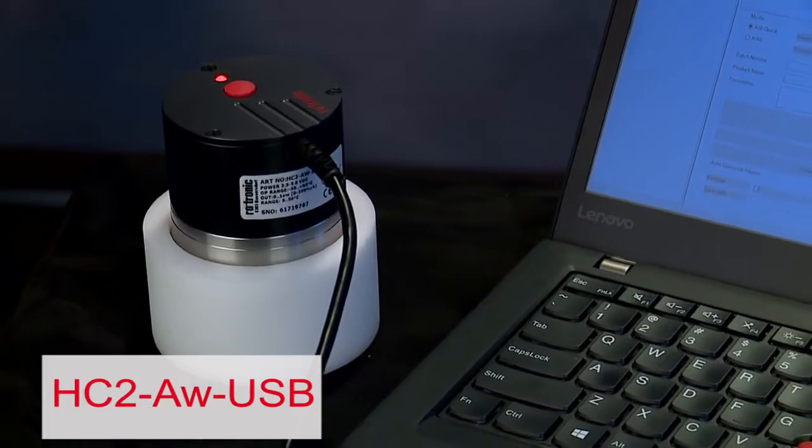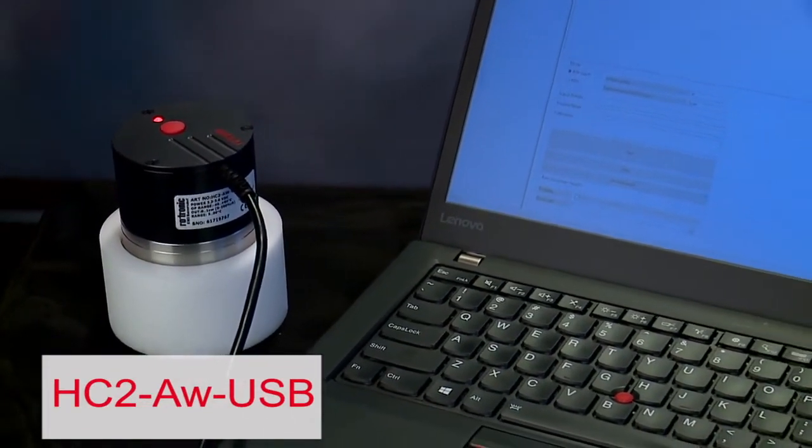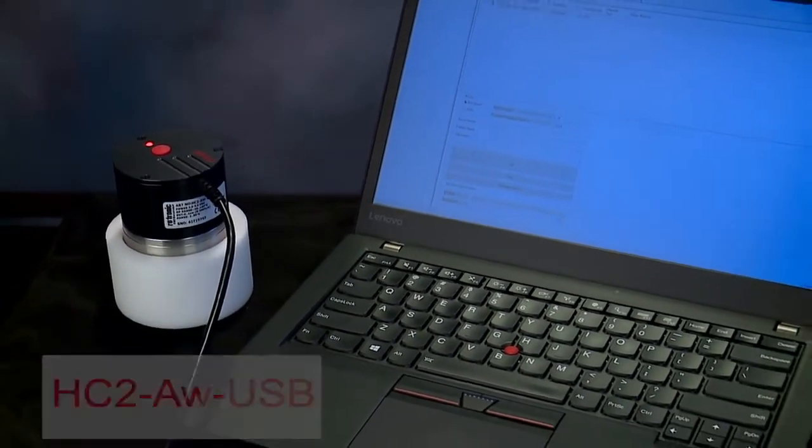Hi, in our first video on water activity measurement, I reviewed Rotronic's line of AW instrumentation and demonstrated the ease of testing using the HC2AW USB probe and Rotronic HW4 software.